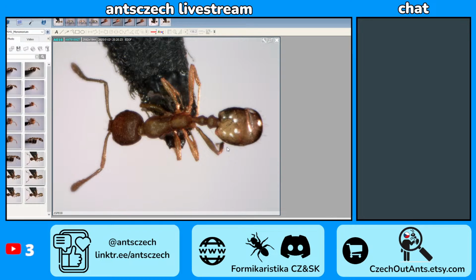I have some ants here. How did they end up? I made a plastic box where I put foam, a pin with some Camponotus, and below it tissues with water and ethanol, and it looks like the specimens are, oh yeah, it worked.